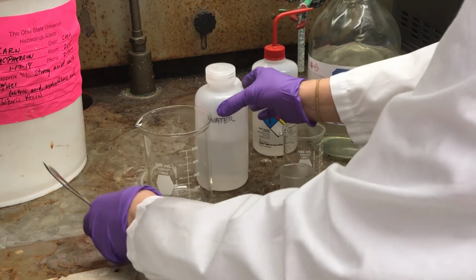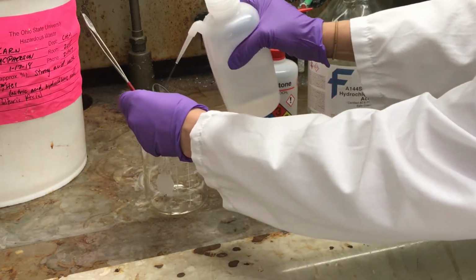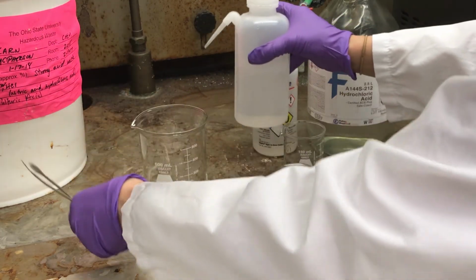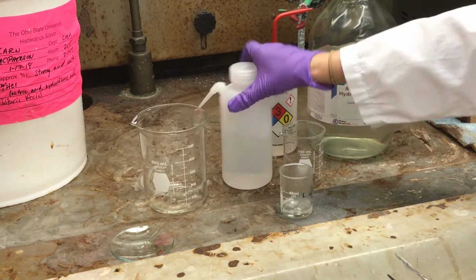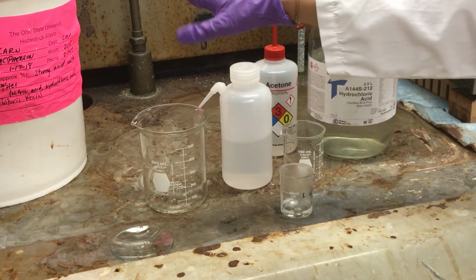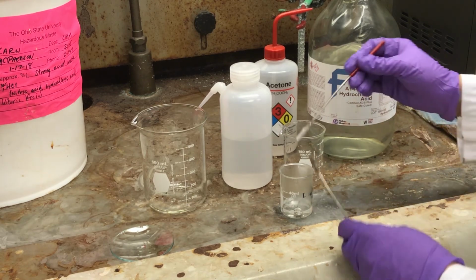So I'm going to rinse this with some water. I have a waste beaker here for water, so I'm just going to put that in here. Because this has come in contact with the acid, I'm going to put this into the acid waste container that is also located in the hood. It's a bucket with a pink label on it.